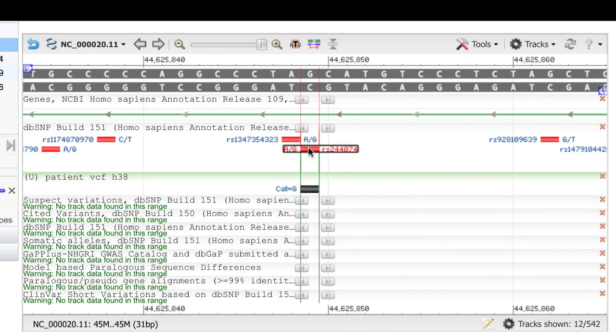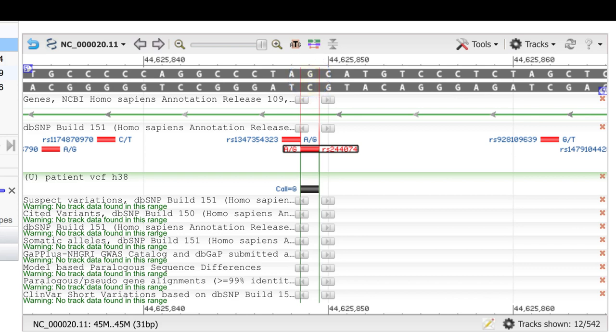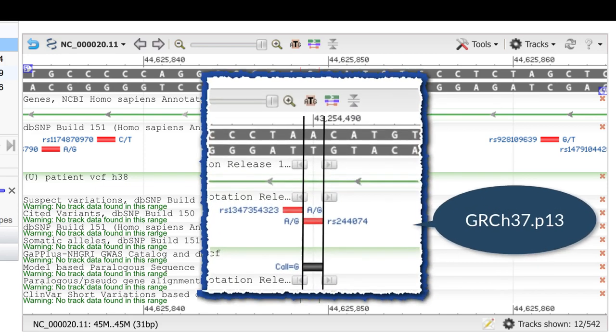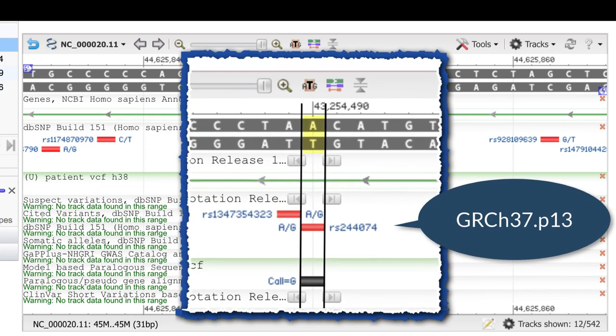We see that the called G corresponds to a known refSNP RS244074 and matches the reference assembly, G, at this position. As a side note, for those of you working in GRCh37, this position is an A. So for specific locations of interest, it's good to check the latest assembly.